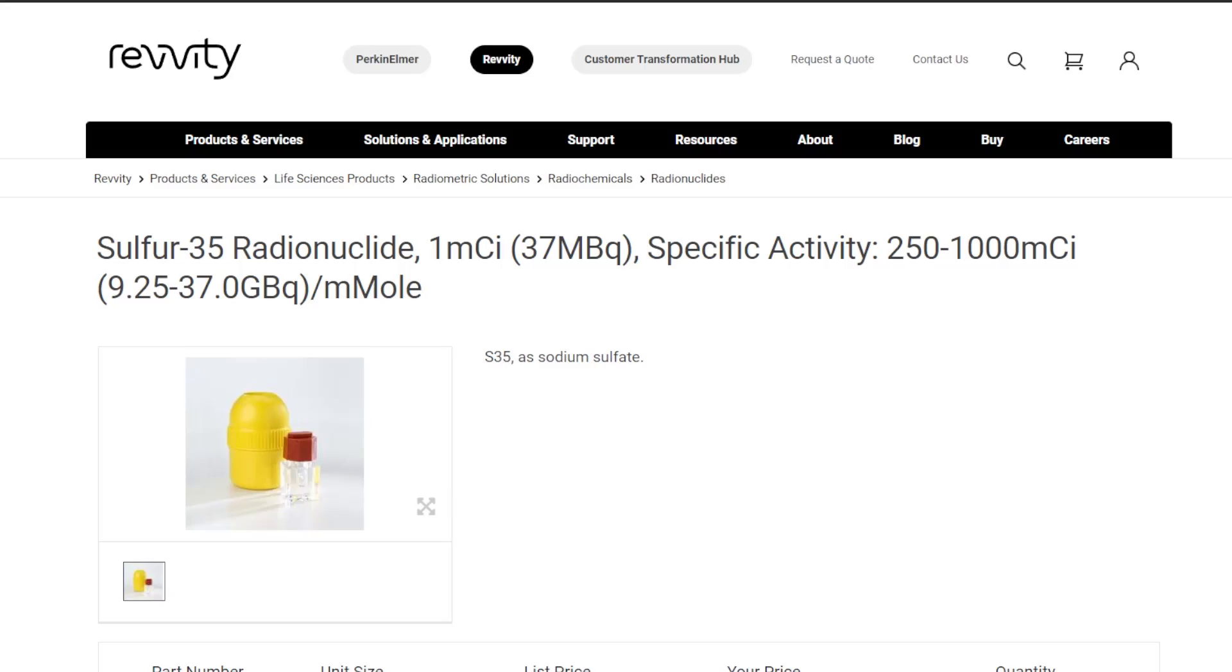Although I explained how to produce Sulfur-35 through the irradiation of sodium chloride, the quantities generated in this video are not sufficient for a stock solution suitable for practical use.